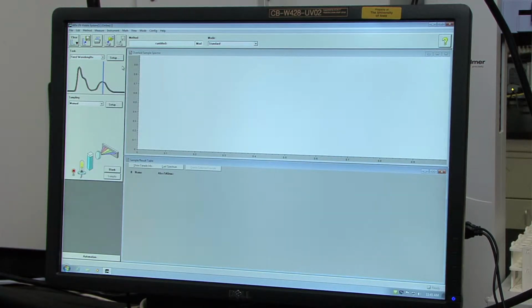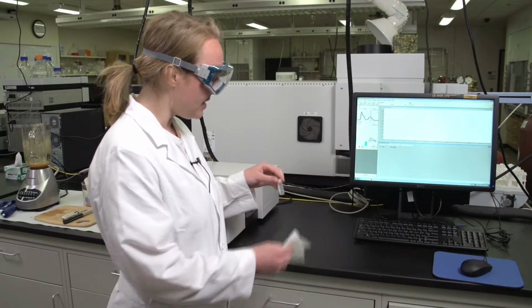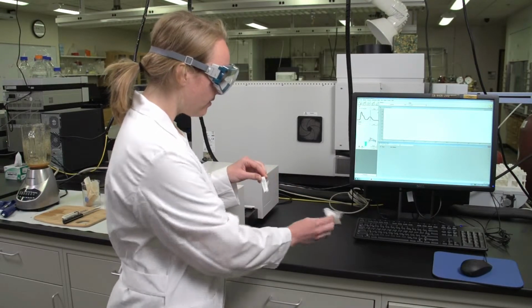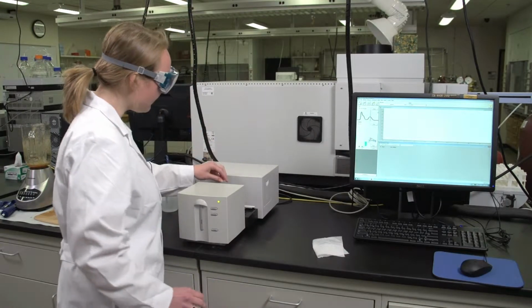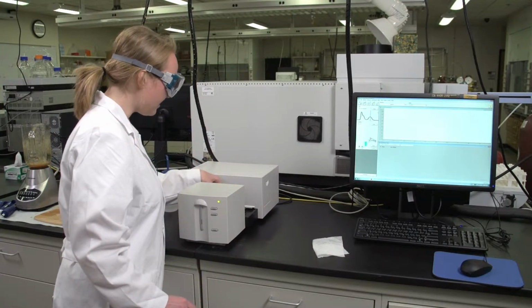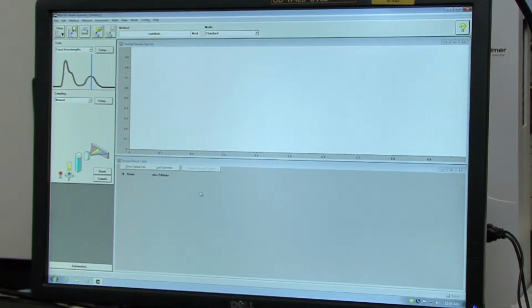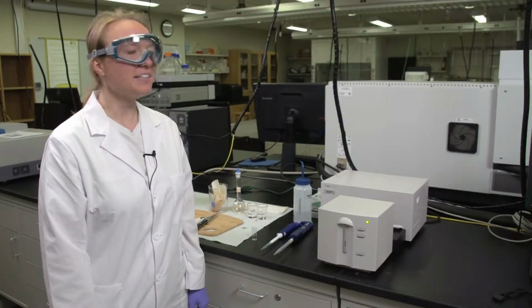And now you want to take the blank spectrum. Fill the cuvette with DI water and wipe the outsides with a Chem wipe to remove all fingerprints and oils. Then place it inside the sample compartment chamber and press the arm down to lock it into place. To collect the blank spectrum, just click on the blank button and that will collect. Now we're ready to collect the data.